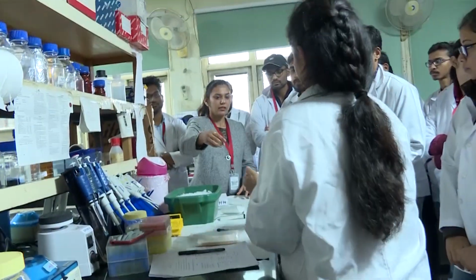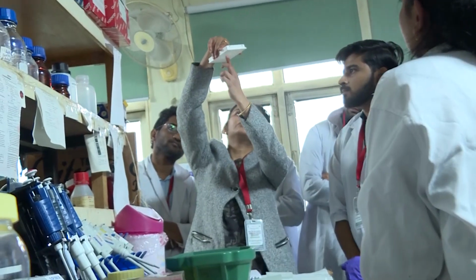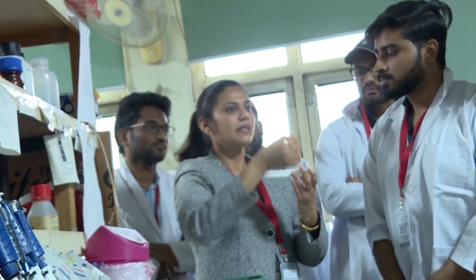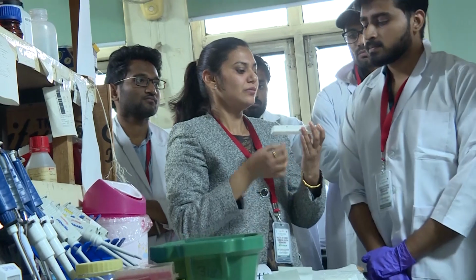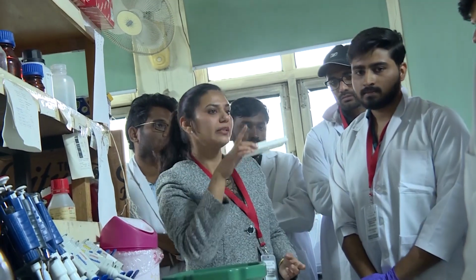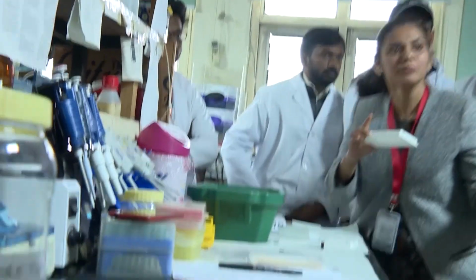Now I can see all the samples are at the bottom. There is no air bubble. Sometimes it happens that some samples may stick at the wall or maybe there is an air bubble. So by spinning it will be okay. Now we will keep it in the machine. Please come to the next room.